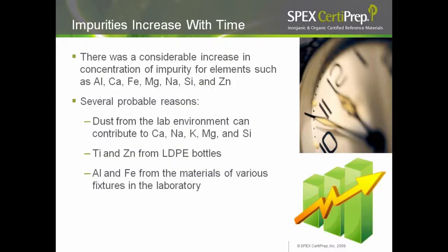Impurities can also increase with time. We found a considerable increase in concentration of elements such as aluminum, calcium, iron, magnesium, sodium, silica, and zinc over time. There are several probable reasons: dust from the lab environment can contribute calcium, sodium, potassium, magnesium, and silica; titanium and zinc can come from LDPE bottles; and aluminum and iron from materials of various fixtures used in the laboratory.